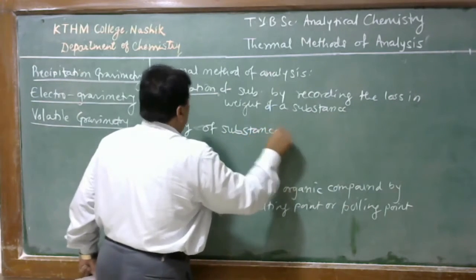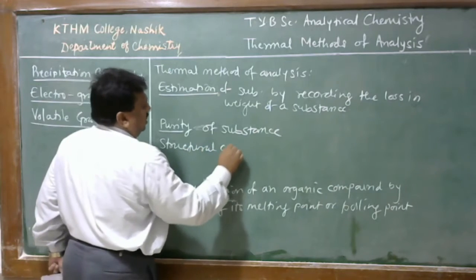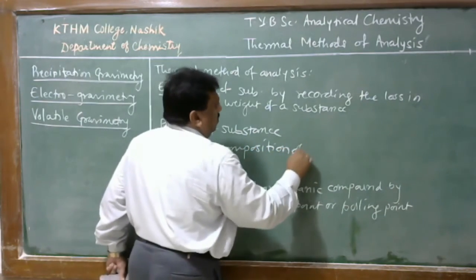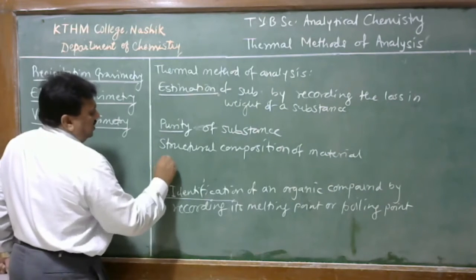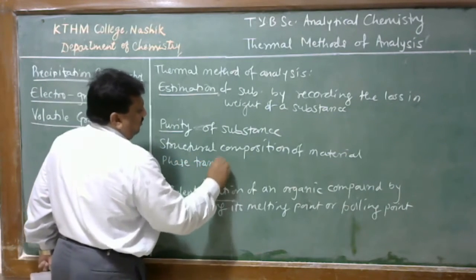In addition, the structural composition of the material is measured. Then thermal methods are used to determine the phase transition temperature.